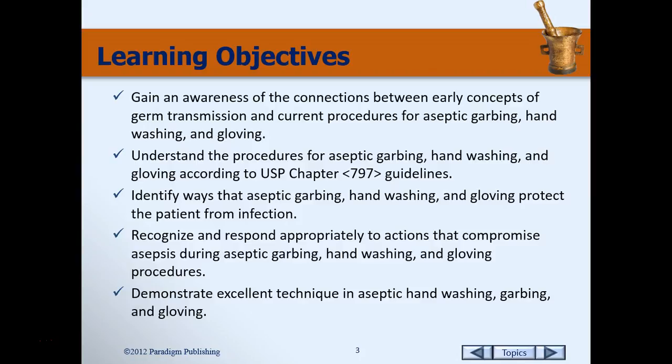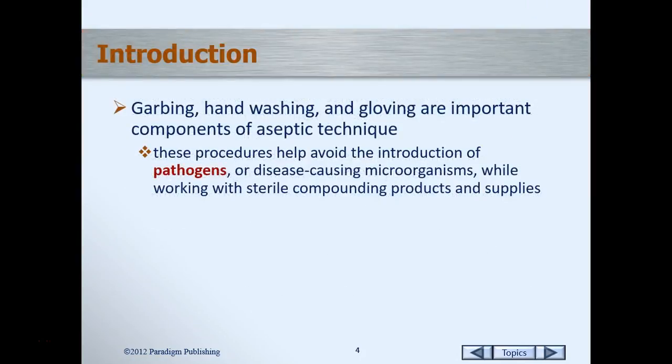Demonstrate excellent technique in aseptic hand washing. So the final component of this chapter, after you've had an opportunity to practice, will be to have a proficiency process validation checkoff in lab.